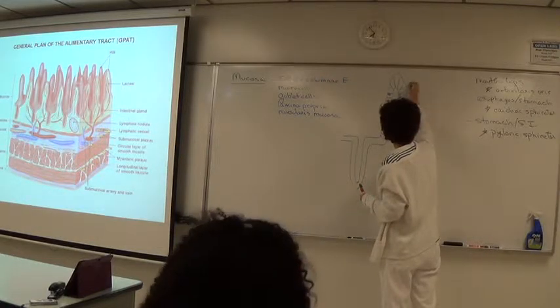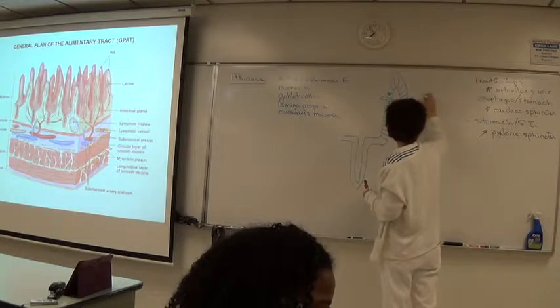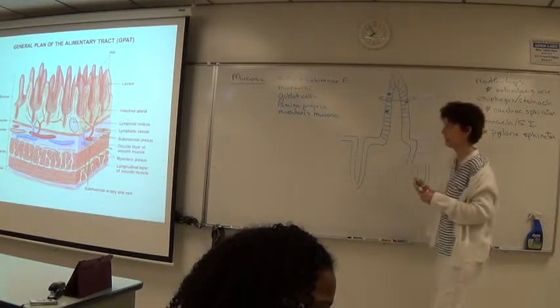Microvilli. So this entire structure is identified as a villus.